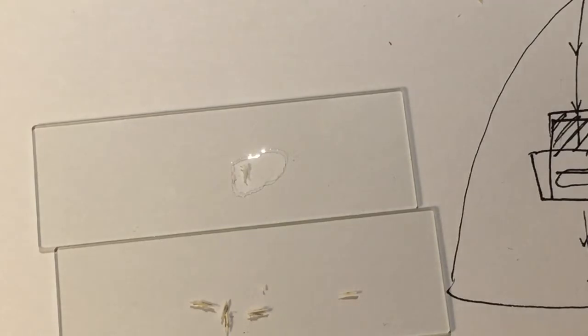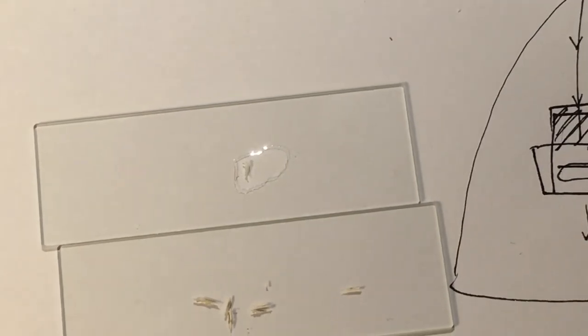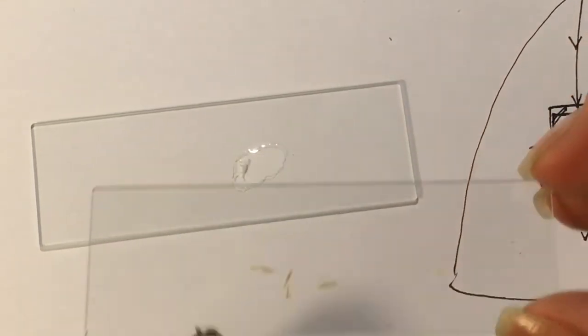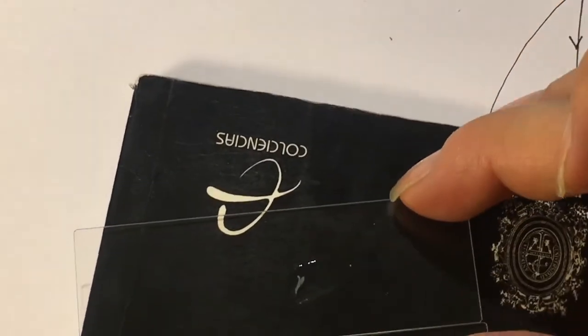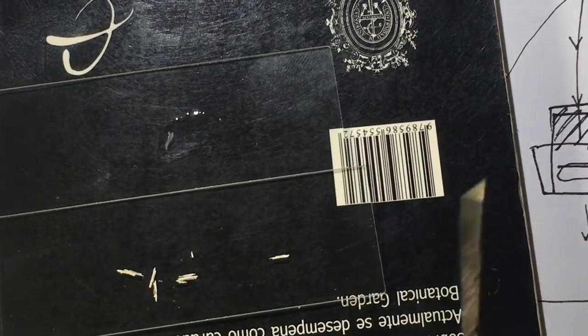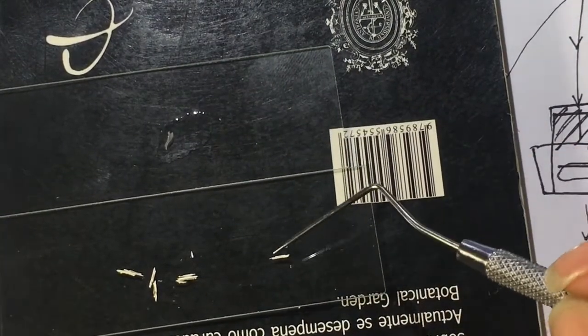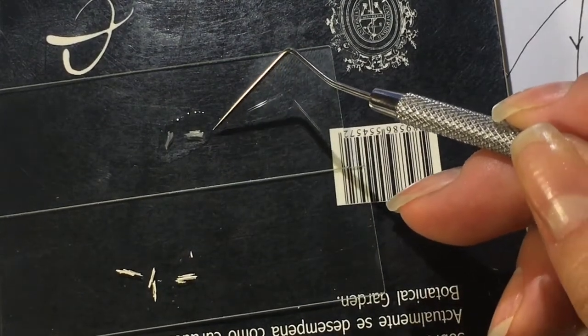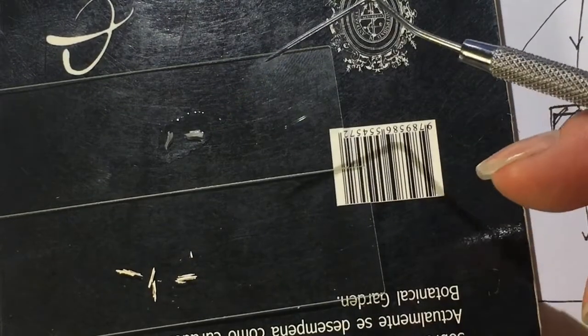Actually, I feel like a black background would be better for this. Do I have anything black? Yeah, I do. If you observe, it takes a while. It's not always very fast, but it will increase in size.